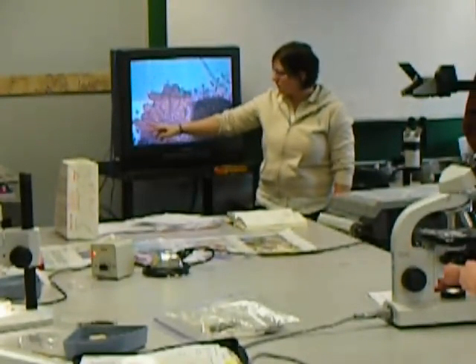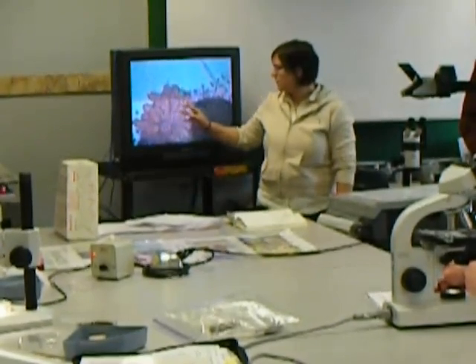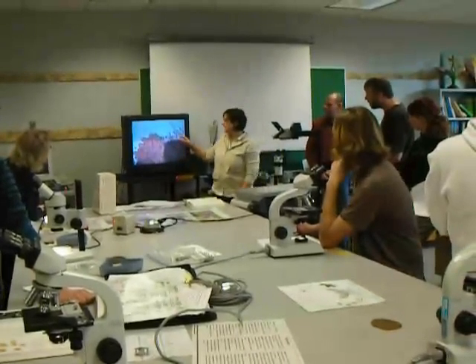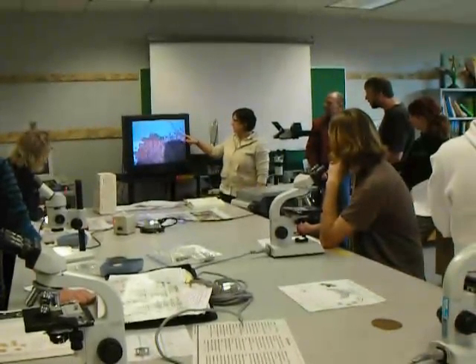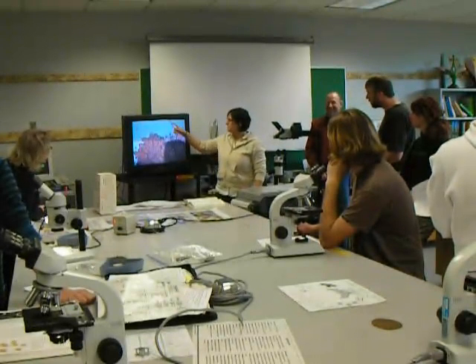You can see that they're all sort of starting to change right here. You can see them all. And that's how you can identify it as the Phyllactinia — with this neat little shoulder here, which actually looks a lot like wild gingers or flowers, Asarum sedatum.